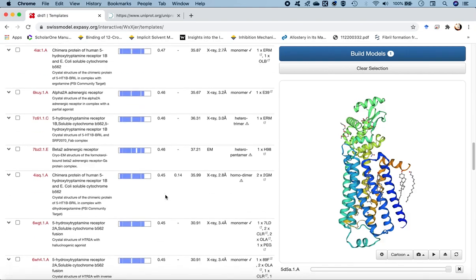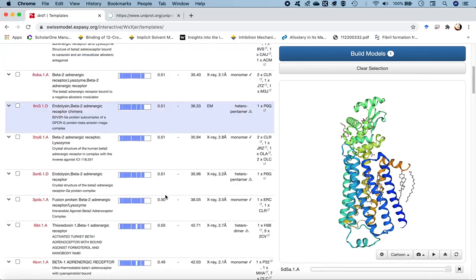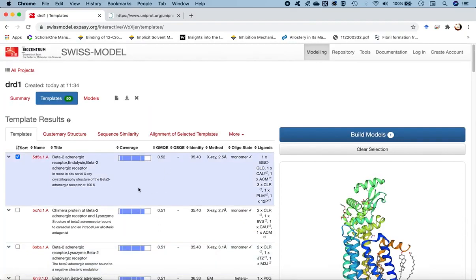So these scores are calculated taking into consideration a number of factors. But out here, the information that you see that is taken into consideration is the coverage, first of all, that is how much of the sequence is covered by the template, like how much of a match it creates according to the residue spaces or the regions in the residues, and the identity percentage as well.